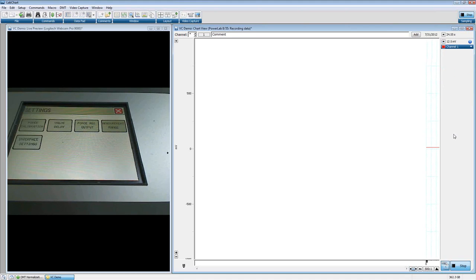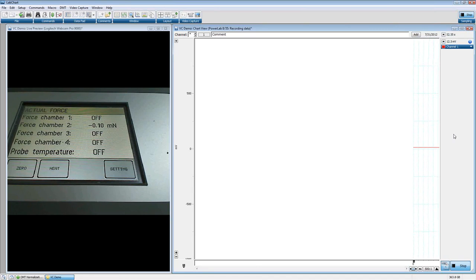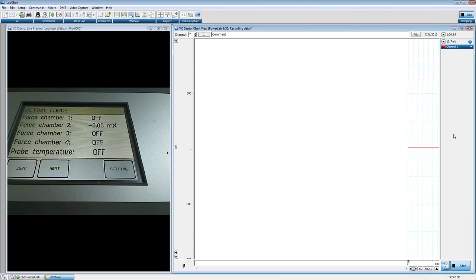I'm going to reach over to the DMT system and show you a few things about it. I only have one chamber connected, so you're going to see Chamber 2. There are a couple of things we need to set up before we even think about calibrating. Some people miss these, and if they aren't set correctly, your data ends up looking digitized — it comes out with larger steps in resolution than you'd really like. That's simply because we haven't set these things properly.